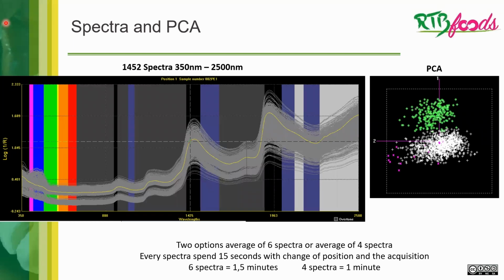Thank you. Very nice presentation, Luis. My question is whether you have tried to look at the central part of the root. Is it possible that the central part would represent the average of the distal and the proximal, and you could save some readings? That is another thing that we need to check, because we need to check if the central part with this spectra is significant for all the roots, and then we need to use different roots to check if it's significant for all the plots. But yes, that is something that we need to do. Thank you.